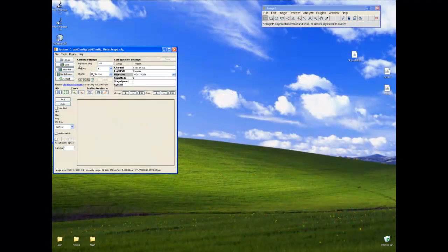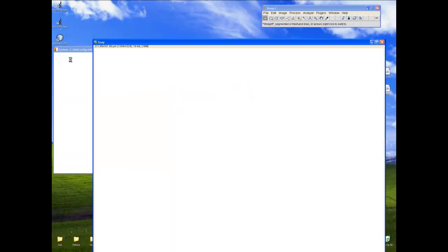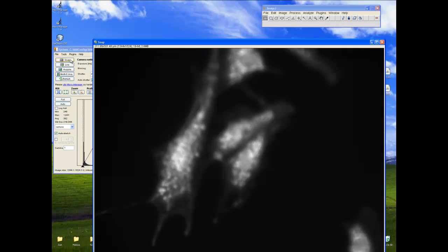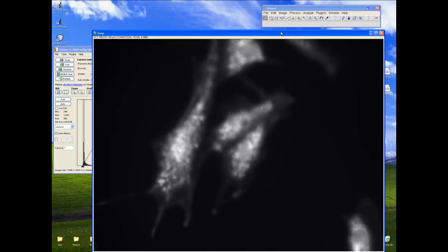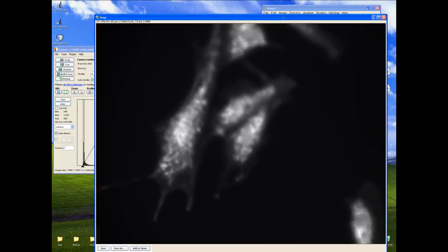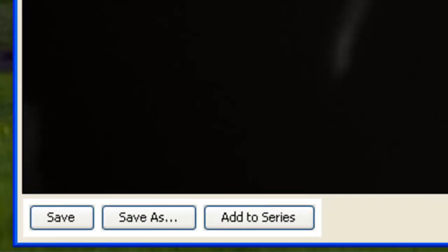We can start off by selecting Snap, which then displays the viewer with a snapped image. From there, we can choose to save the image or add it to a series of images. Before we do that, let's move up the window. There it is.